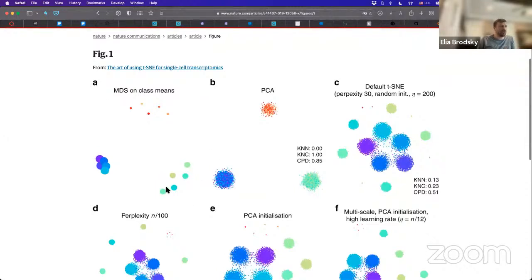So let's first of all take a look at this example. What is multidimensional scaling? Multidimensional scaling basically assumes multidimensionality. We can use something like NMDS, non-metric multidimensional scaling, or metric multidimensional scaling. But the basic idea is that we have counts of these UMIs, and we want to identify distances in either a metric, linear, or a non-metric, non-linear space.